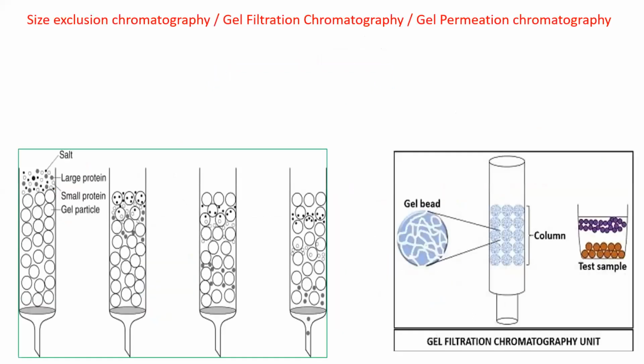So moving further, today we are going to see size exclusion chromatography. It is also called gel permeation, and it is also called gel filtration chromatography. So we are more interested in discussing, say, proteins, because in biochemistry and biotechnology we will always be dealing with separation of biomolecules from a given mixture. Now, these biomolecules can be produced by bacteria, or they can be extracted from some other living source, or you can even make them artificially in the laboratories. So you can synthesize them synthetically also.